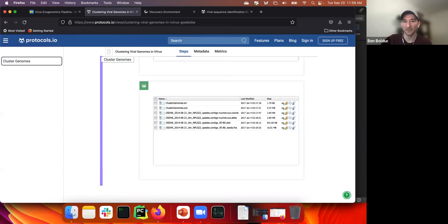I use base pairs by standards, and I use the quality controlled results at the end of Trimmomatic, because I don't want to include the adapters and the primers and all that other sequence prep bases, basically.